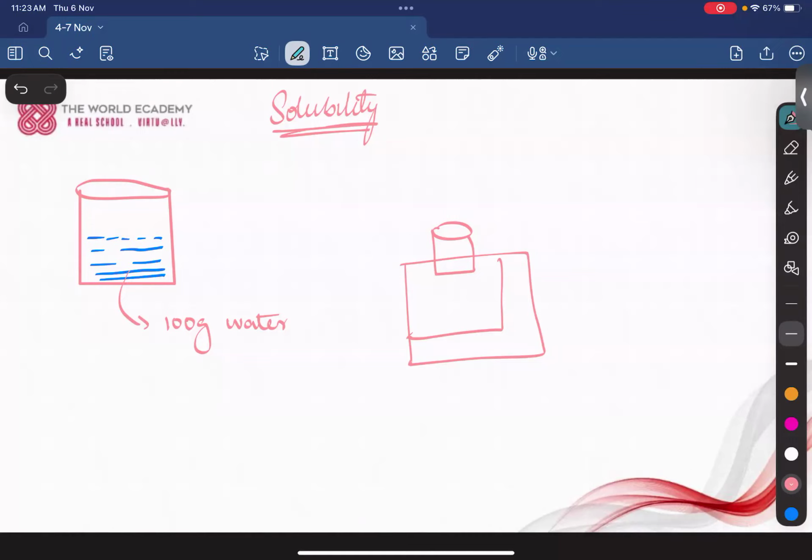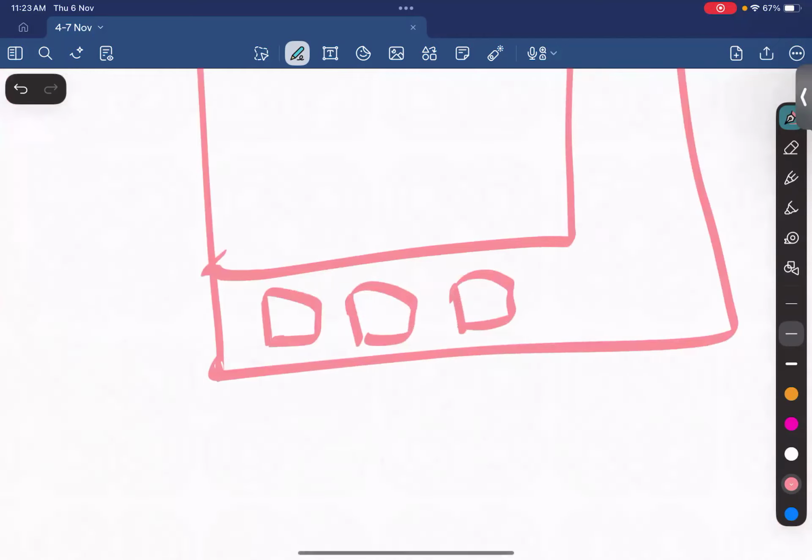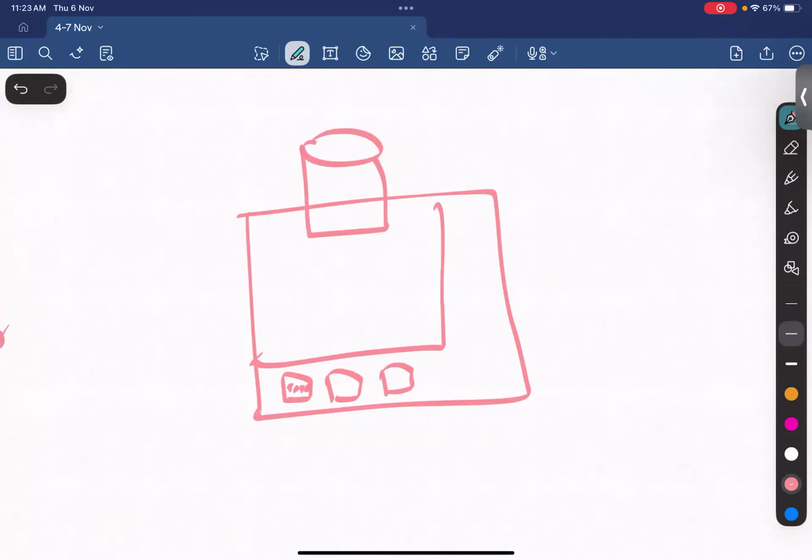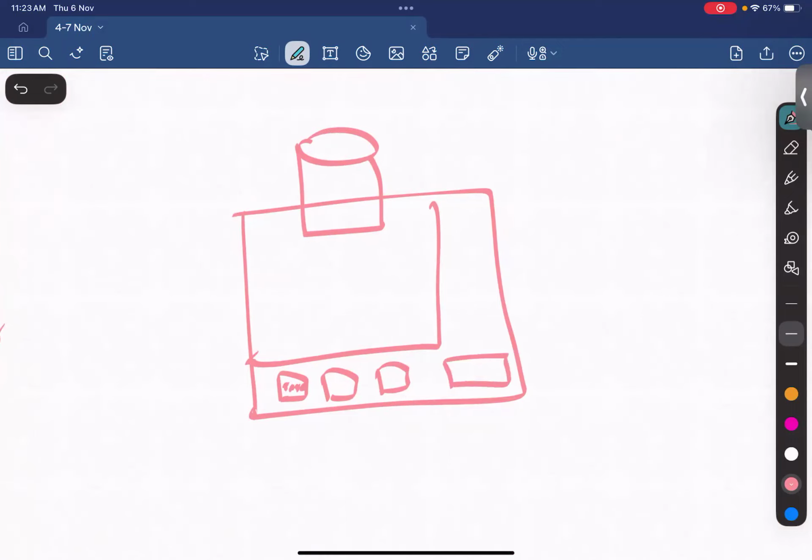There are a few buttons, and one of them is tare. When you press the tare button, the weight indication becomes 0.00.